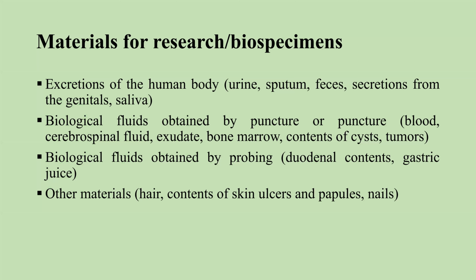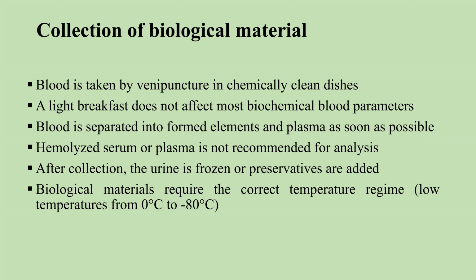Returning to biospecimens: these are all parts and excretions of the human body. It's a biospecimen, and it doesn't depend on the way we obtain it, but biological fluids and some parts of other material are always potentially infected if you work with human biospecimens.